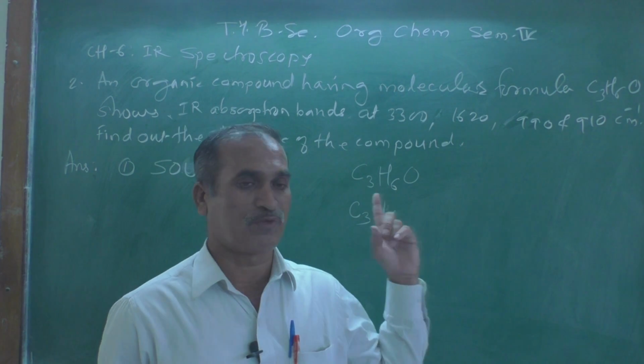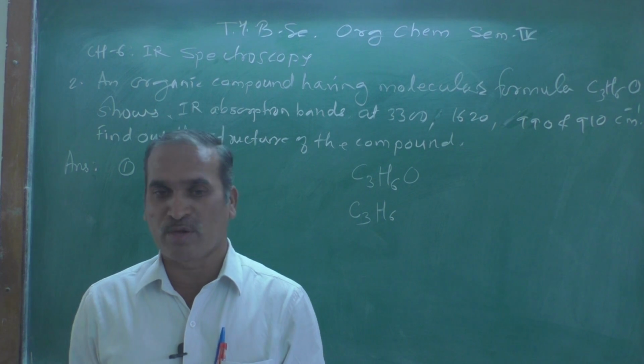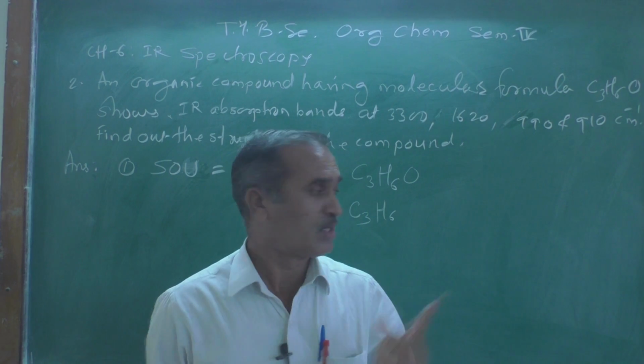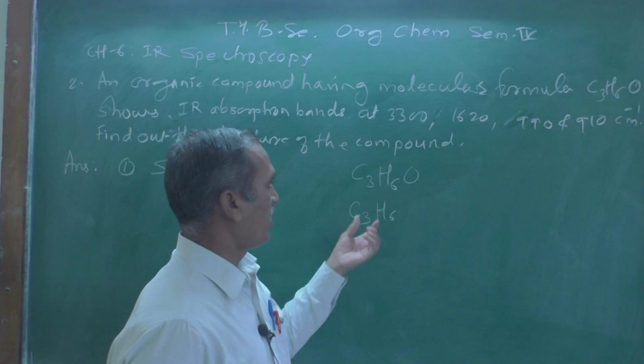But here, if you see this molecular formula, there is no nitrogen atom. So let's see what is remaining.